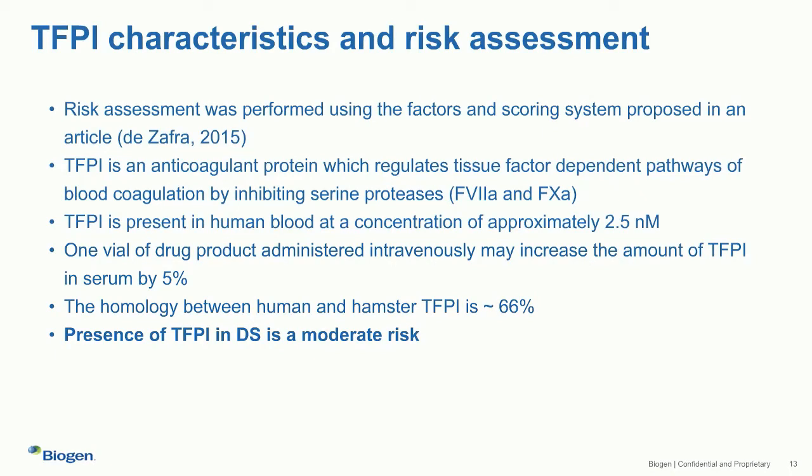At the same time, we also look into the characteristics of TFPI and the potential risk associated with it. Without going into much detail, we believe the presence of TFPI in the final drug substance to be a moderate risk.